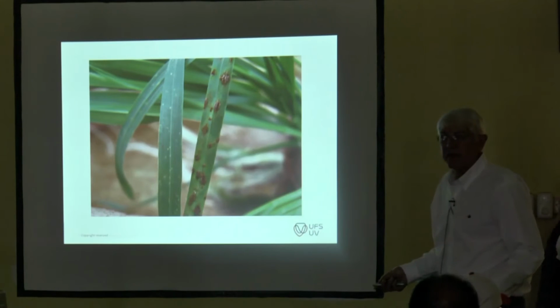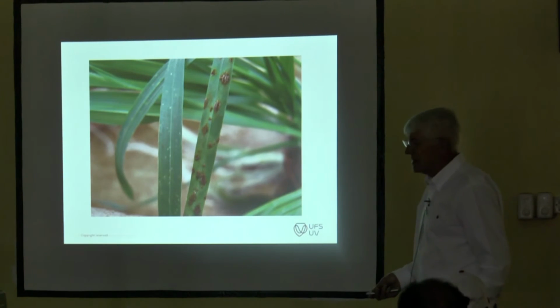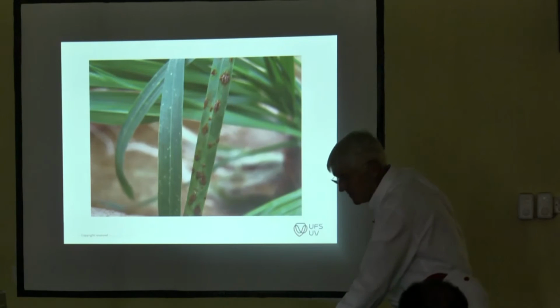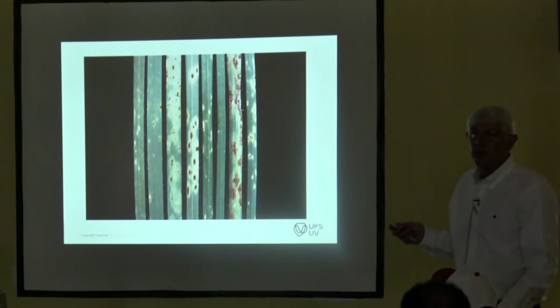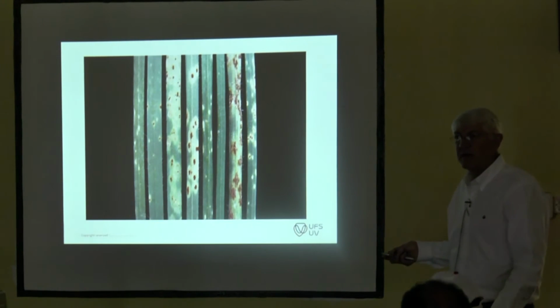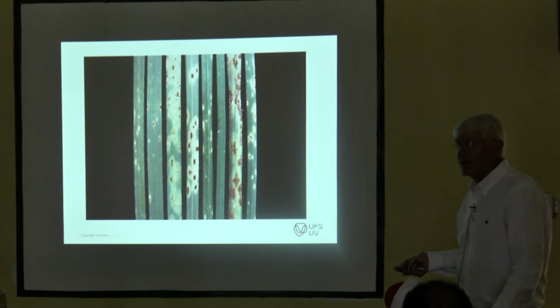A more practical example from a real greenhouse situation, it's quite easy then, I think, to distinguish your low infection type, your fleck, from a full susceptibility when you're doing segregating populations, for instance. This is Aegilops sharonensis, so it's not wheat, but it's infected with Puccinia graminis forma specialis tritici. And you get the same range of infection types, although they look slightly different.